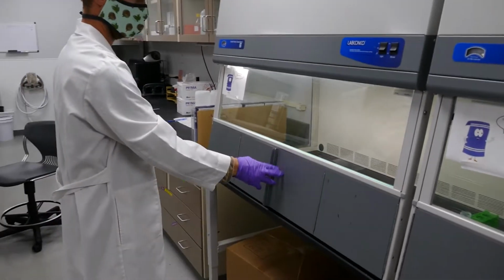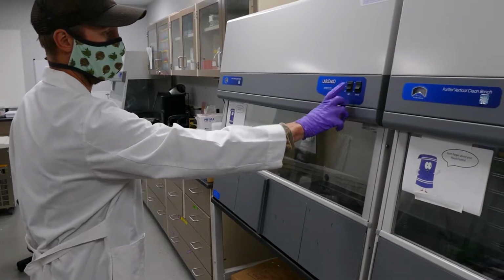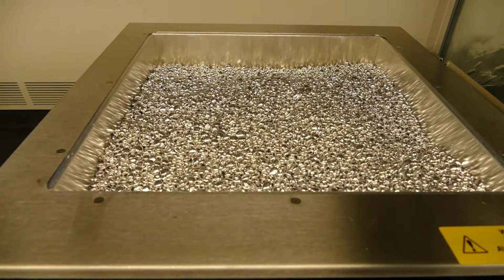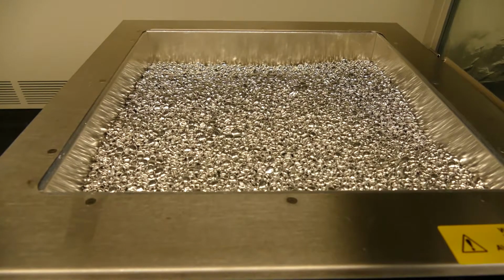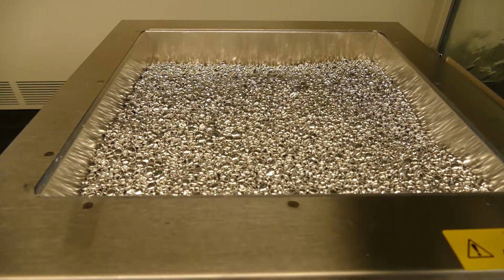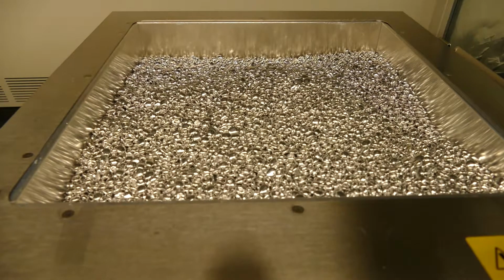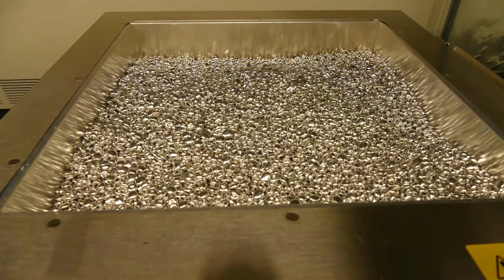Additionally, if samples are drying at different speeds, place dried samples in the -80 freezer while waiting for the rest to dry. One additional tool that can be used to achieve completely dry samples are metallic drying beads in a Lab Armor bead bath set at 55 degrees Celsius. The use of the bead bath should be limited to extreme cases where samples are not drying within the 24-hour period that is preferred. This method is only to be used to avoid prolonged exposure in the drying hood.